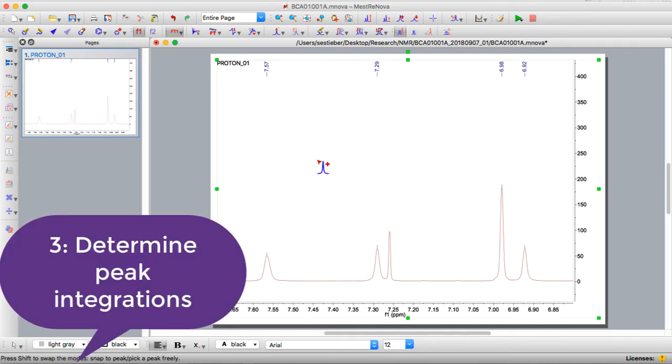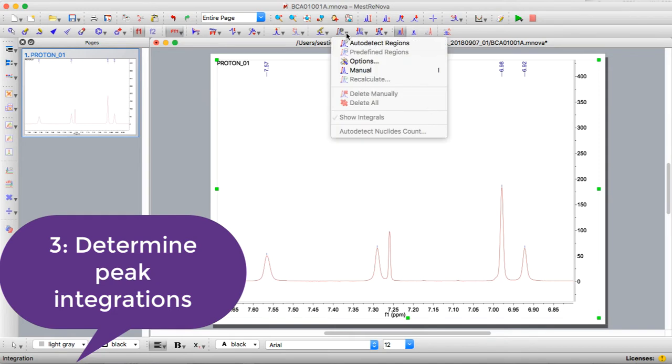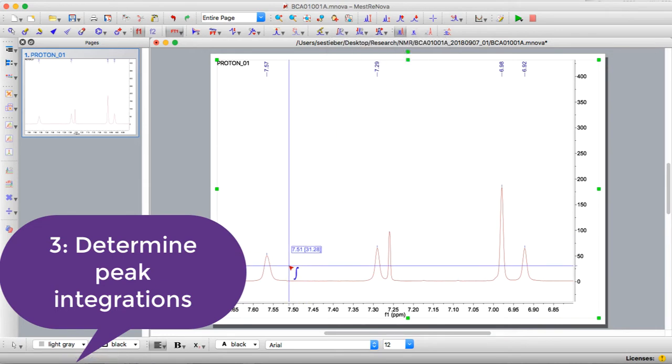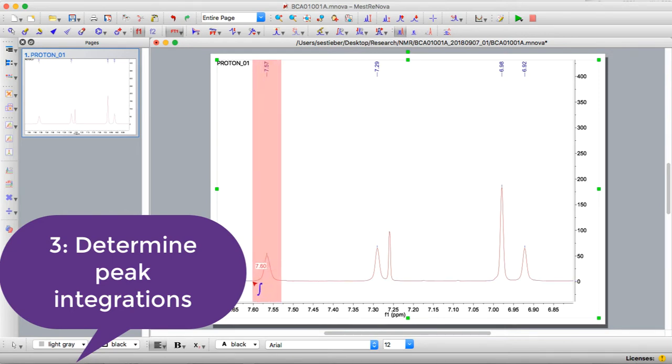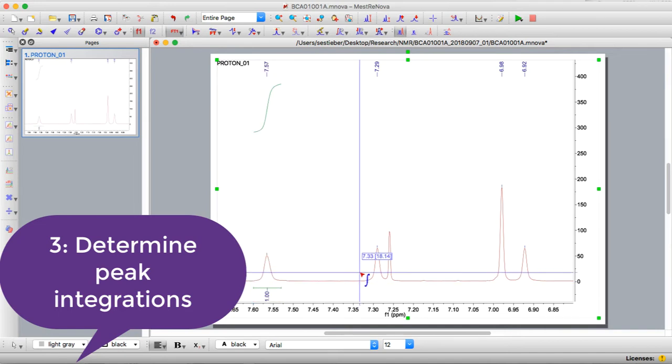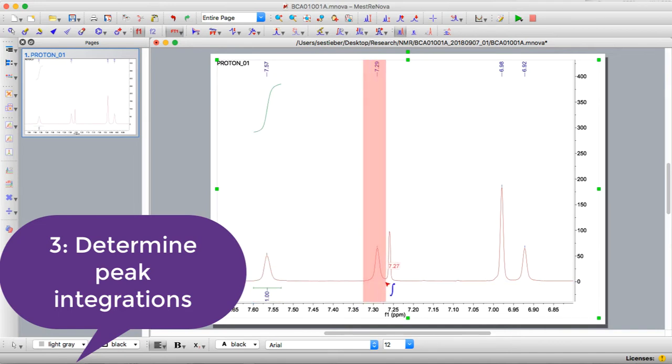Next we want to integrate the peaks. Remember integration helps you determine the area under the curve, and in NMR spectroscopy the area under the curve is related to the number of protons at that position. If you click on this integration button, again use the manual threshold, the short key for this is I, and you'll want to click from where the line straightens out, and then drag and make sure it's approximately even around the peak. Then continue to do that for all the other peaks.